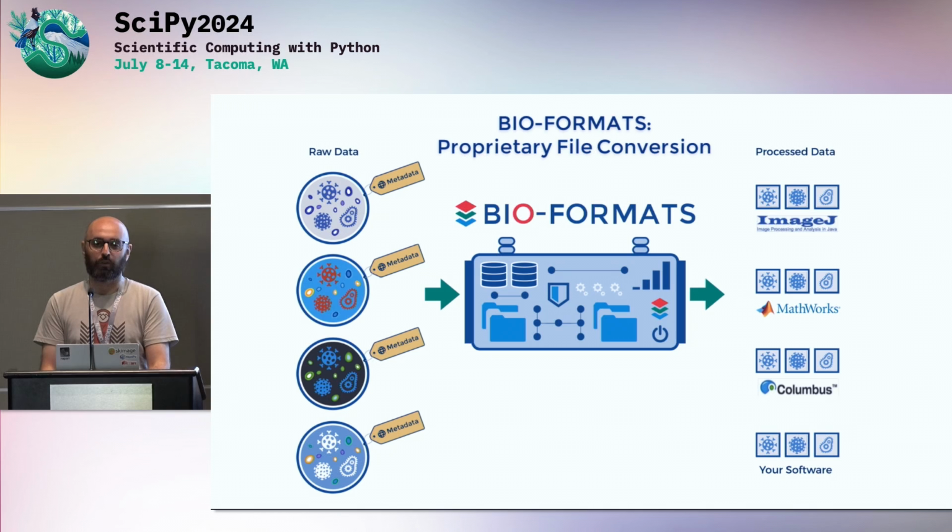It does make a lot of the open source bioimage analysis world work to begin with, because otherwise you wouldn't be able to read data from your Leica microscope unless you have Leica software, or your Zeiss microscope unless you have Zeiss software. So bioformats is the thing that's at the very center of all of this, and it's what makes everything else possible.